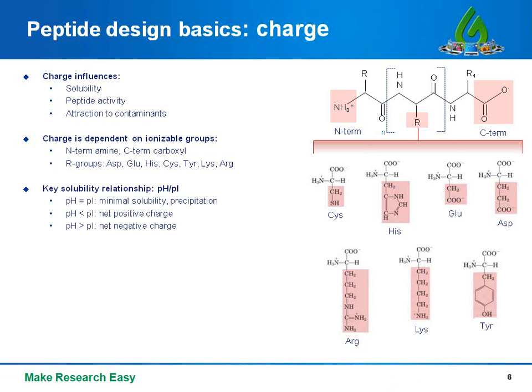For this reason, it's important to consider the buffer or solvent that your custom peptide will be assayed in, as well as calculate its net charge as you're designing your peptide. I'll talk about how you can calculate net charge in the next slide.